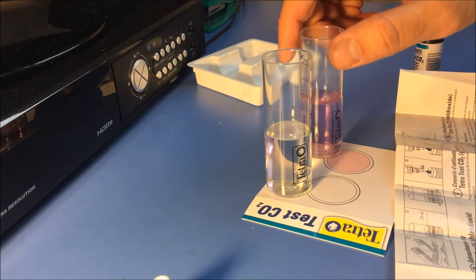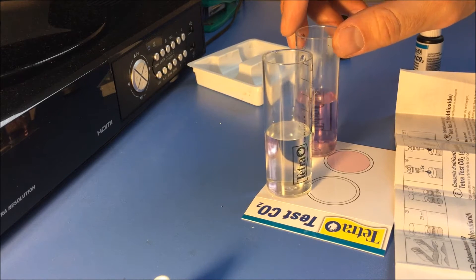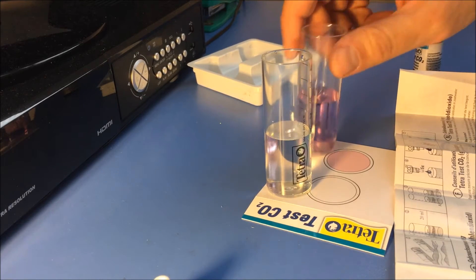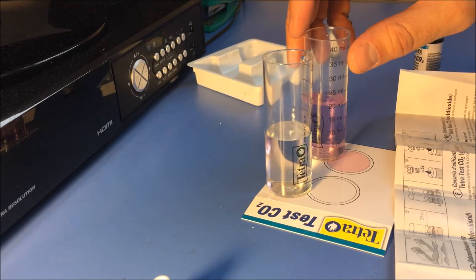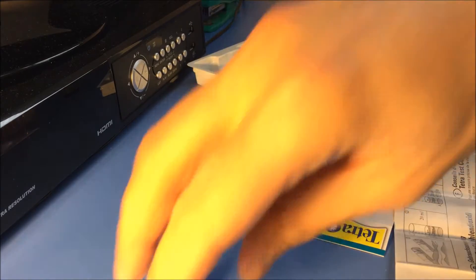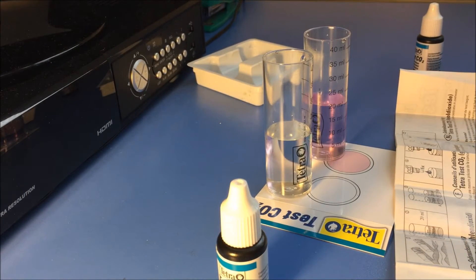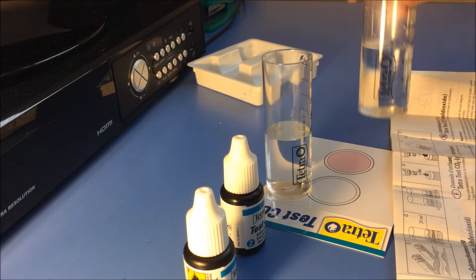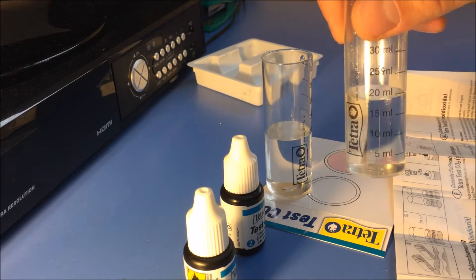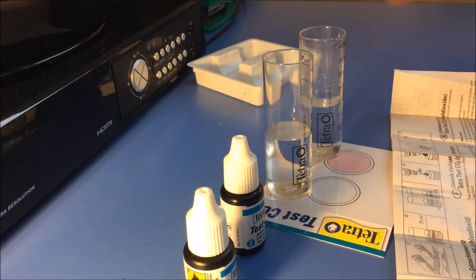Maybe I should do the test again just to be sure. I'm going to fill vial B up again with fresh aquarium water. I added new aquarium water to test vial B and I'm going to do the test all over again.